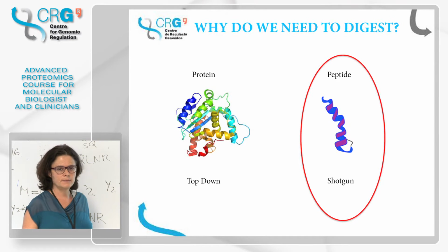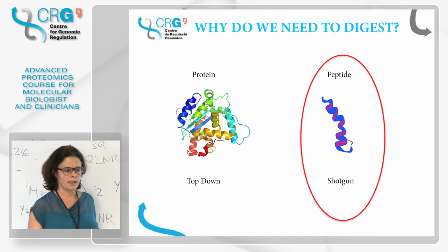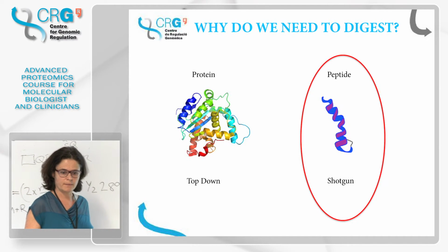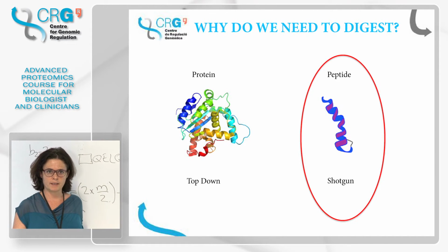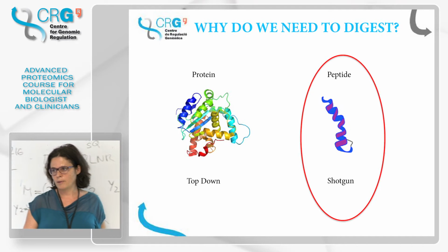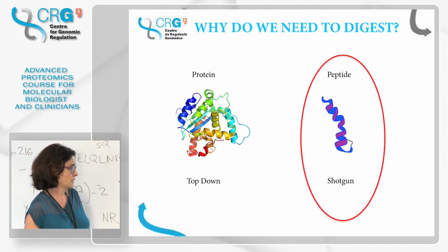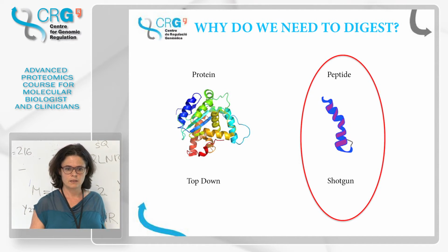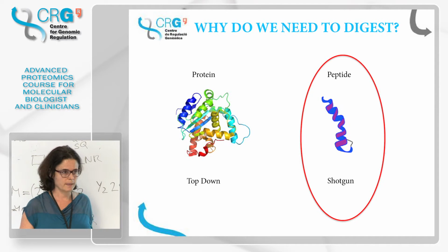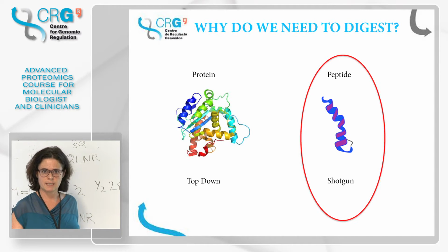But the sensitivity at the protein level is much lower. And also, now we have been working on peptide fragmentation. You have seen how complex an MS spectrum of a peptide can be. When we are talking about proteins, it becomes much worse. But, as I'm saying, they are mainly technological reasons. So probably in the future, when the instruments are better, more sensitive, and the fragmentation is improved, we will work with proteins. But until now, most people are still working at the peptide level.